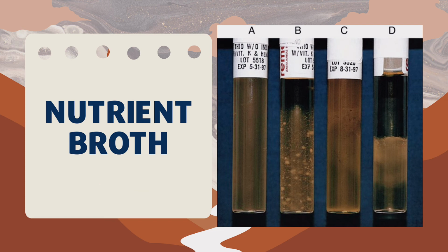Okay, let's say that we already have our baby bacteria culture in our broth. What do we expect? Well, there are 5 things to observe in our bacterial culture in nutrient broth: mainly the surface, the subsurface, the amount of growth, the sediments, and the pigmentation. Even though no is always an option for these, we still need to make ourselves aware because this will help us distinguish and narrow down our long list of possible bacterial cultures present in our broth.